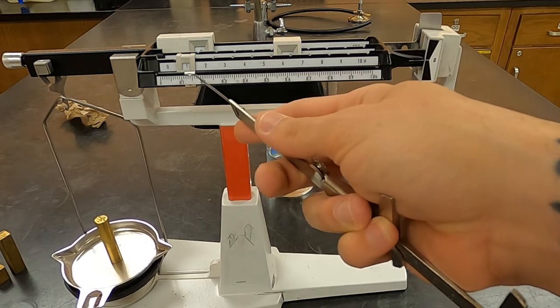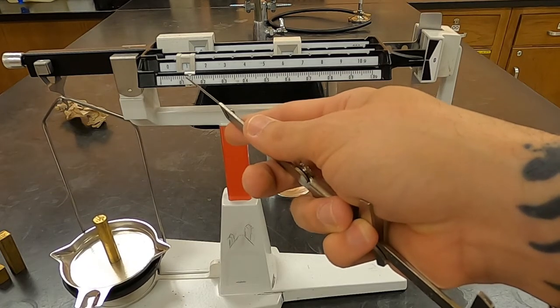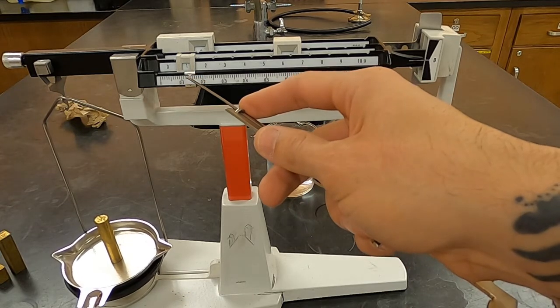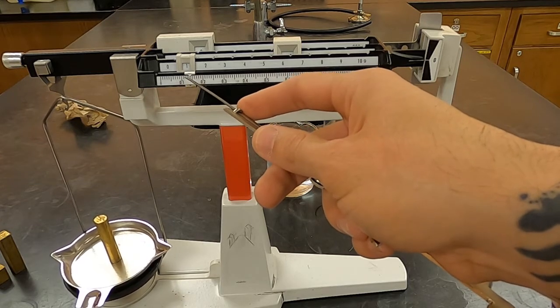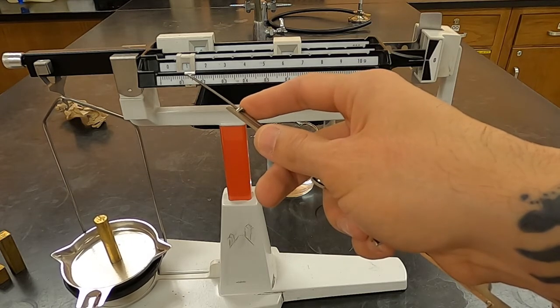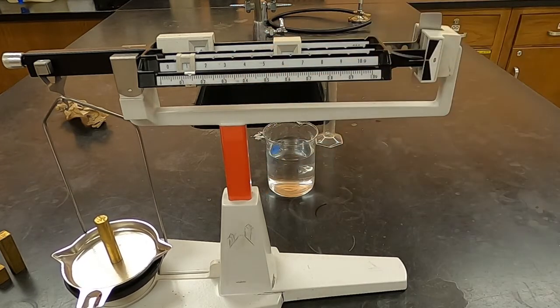Each of these smallest lines is the hundredths place for grams, and so you can see it's 0.11, 0.12, 0.13, 0.14. Because it looks like it's right on the 0.14, and because each of these is 0.01 grams, we need to go one decimal place further, to 3 decimal places. So I'm going to report this as 61.140 grams.